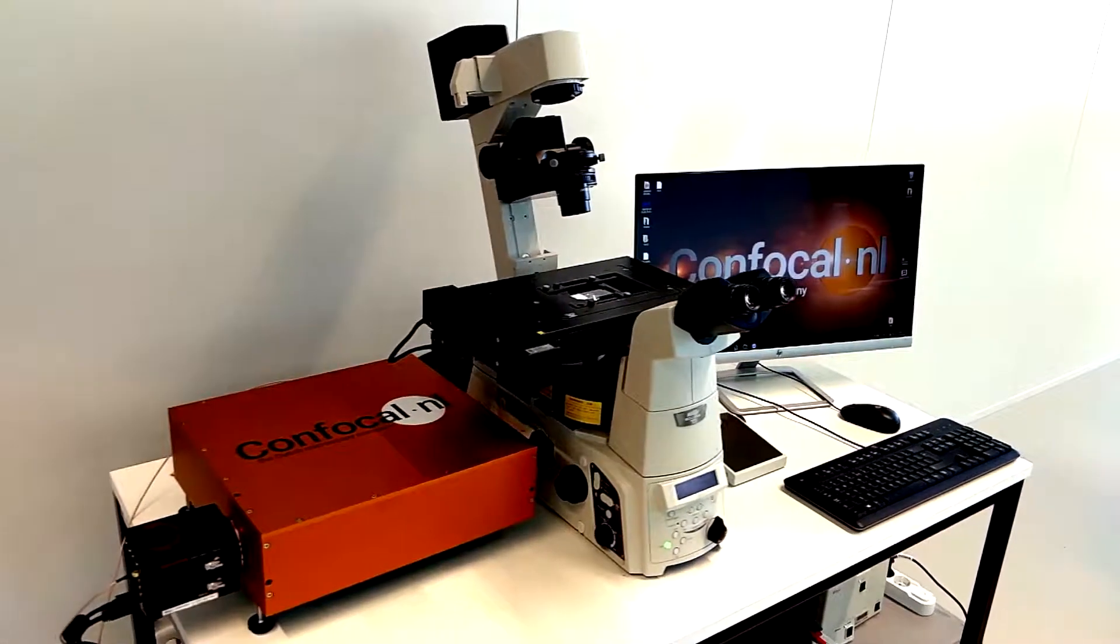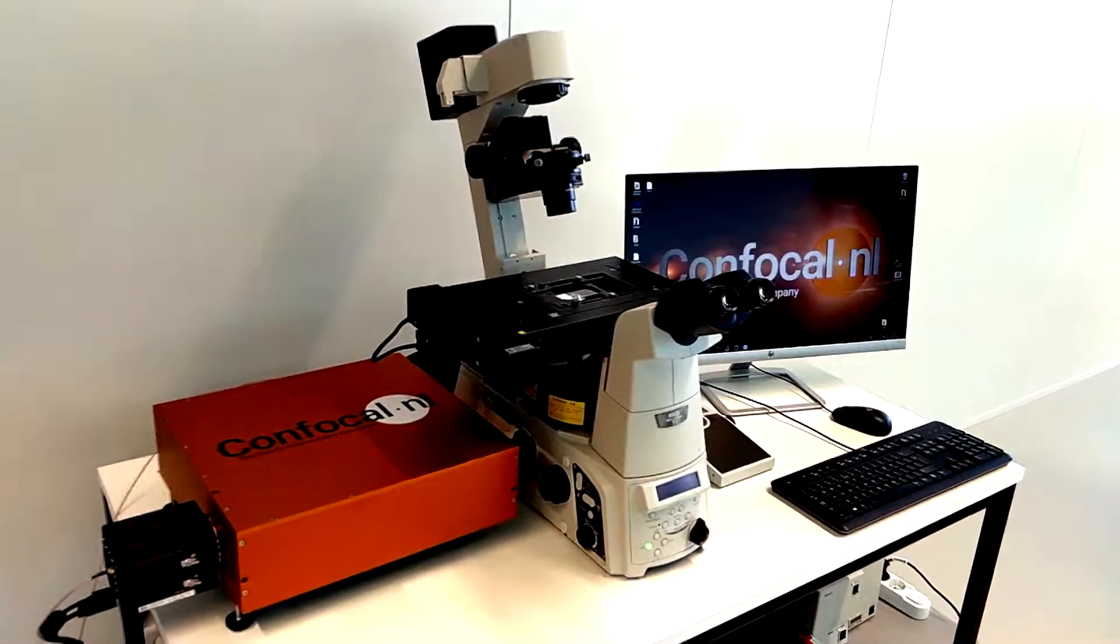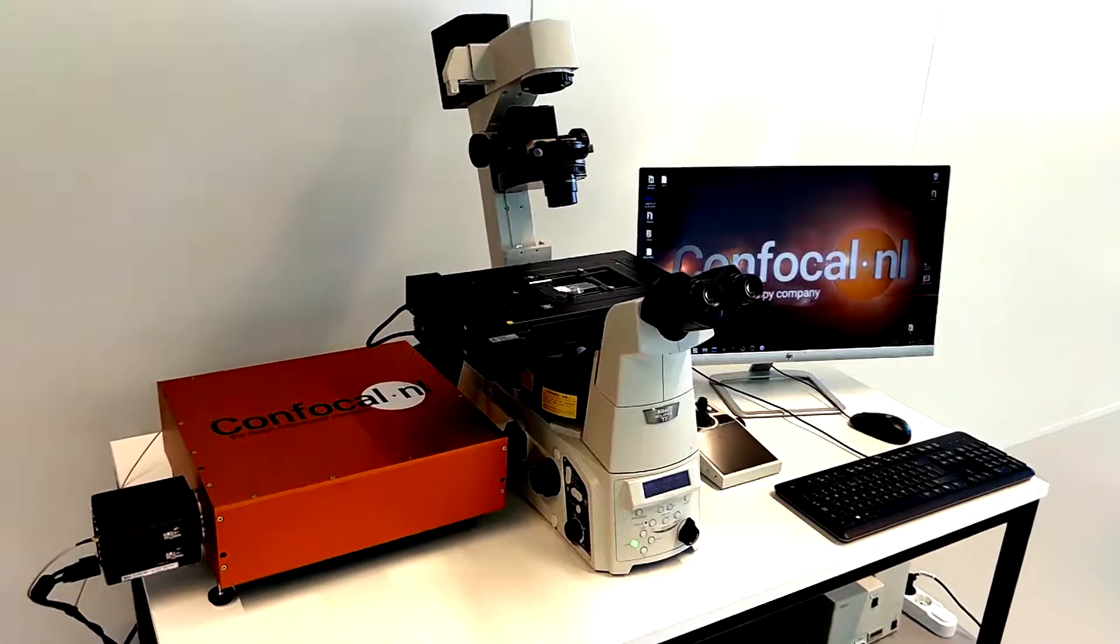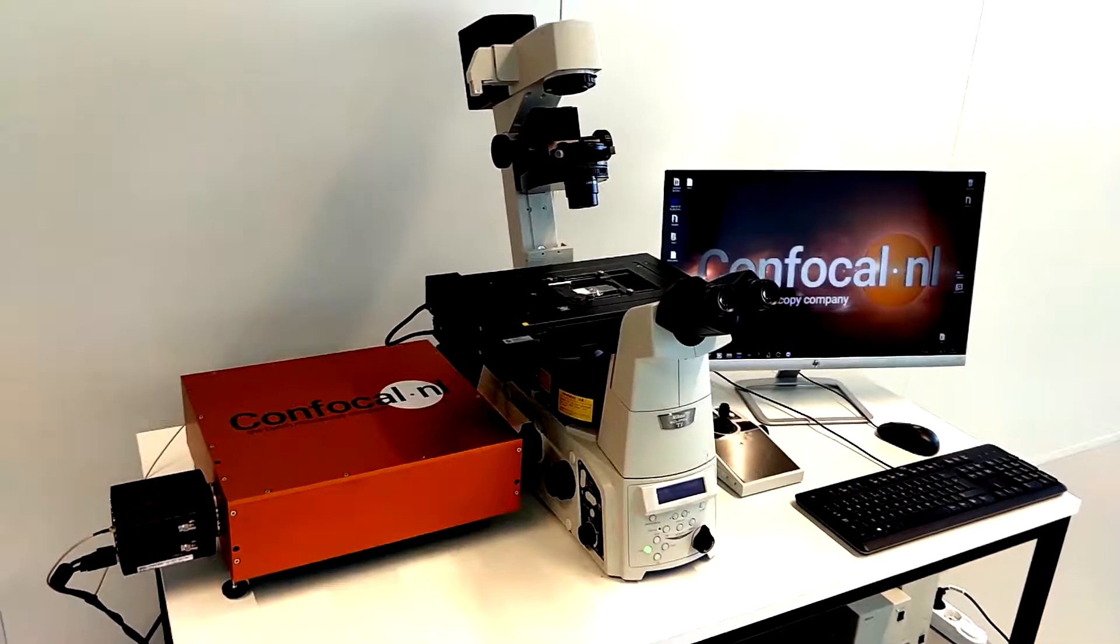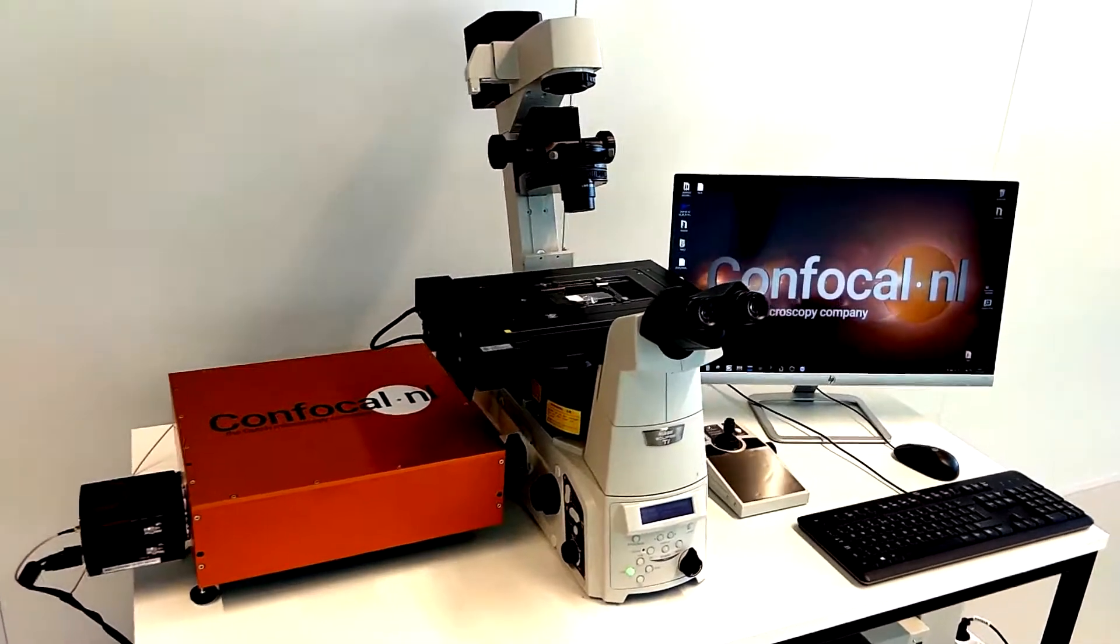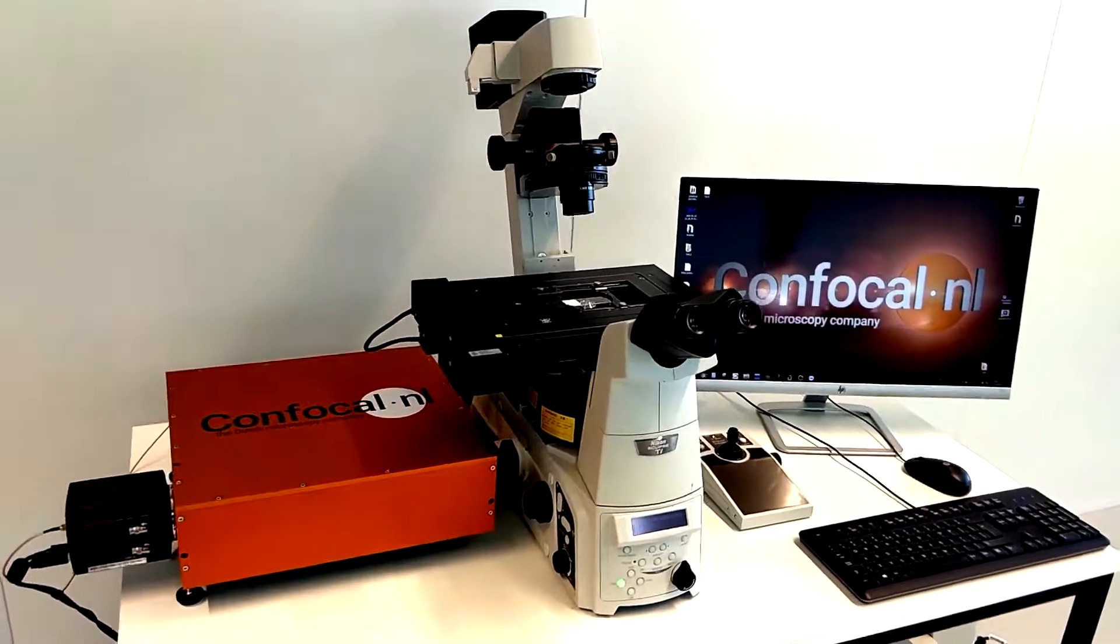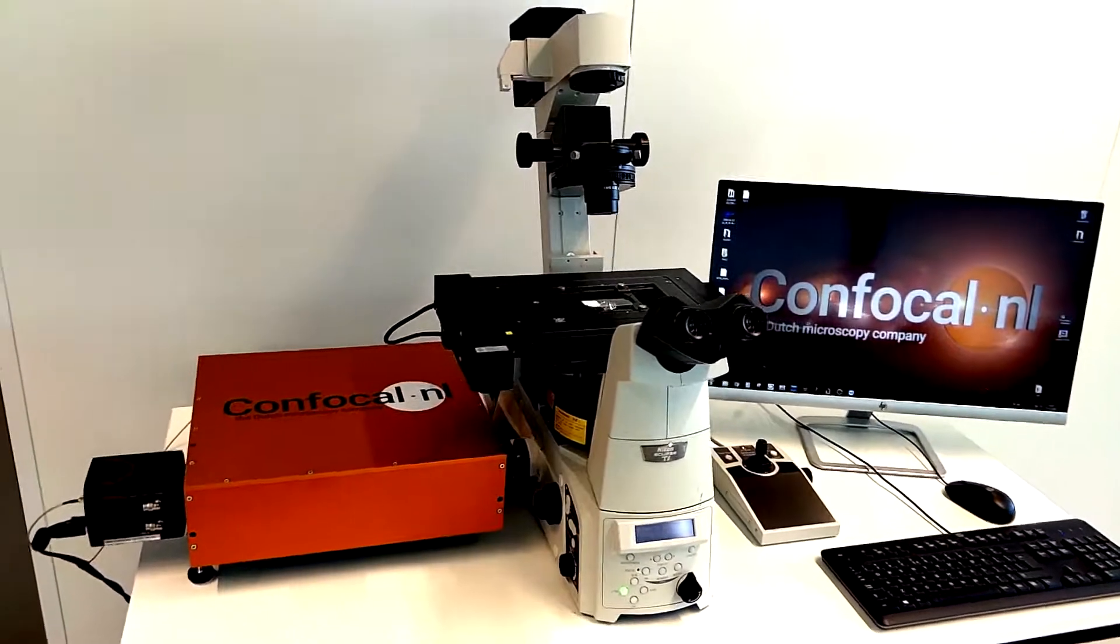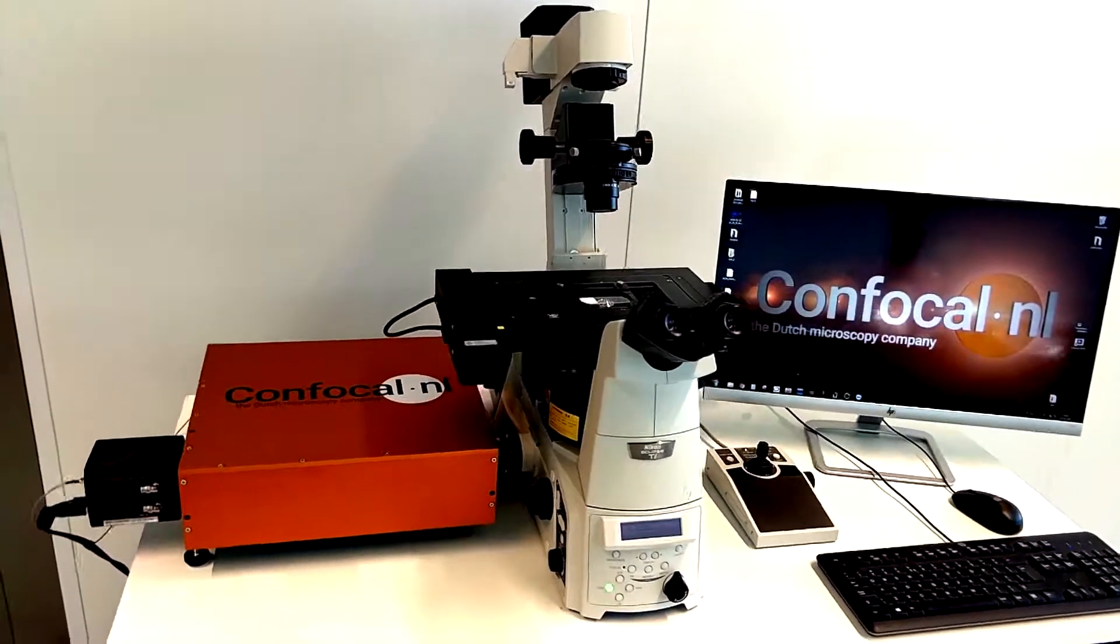Welcome to the tutorial on using Rescan Confocal Microscope, or RCM unit, with the open source platform for microscopy imaging, Micromanager.